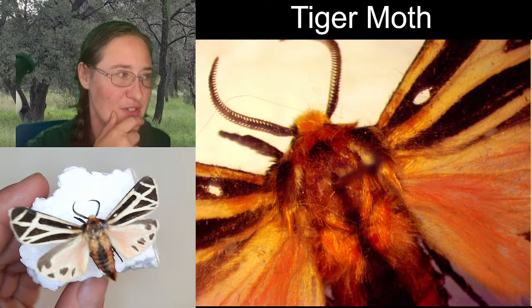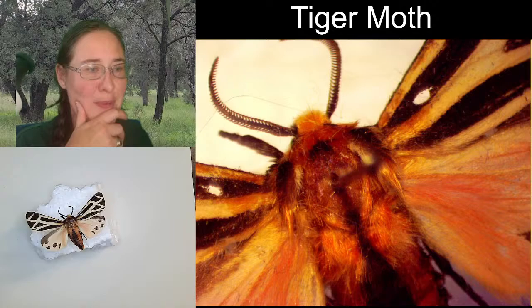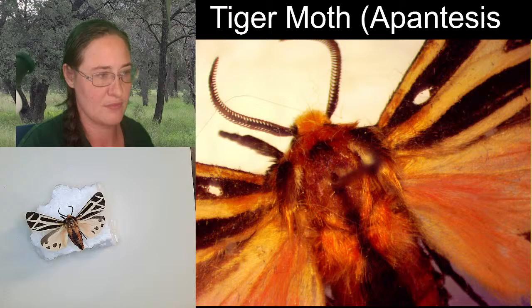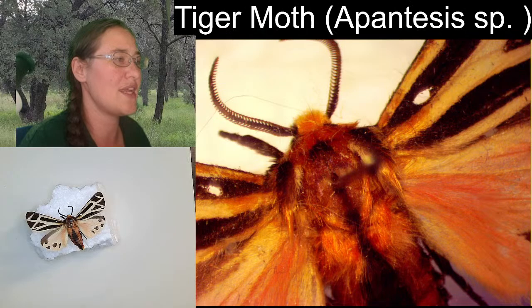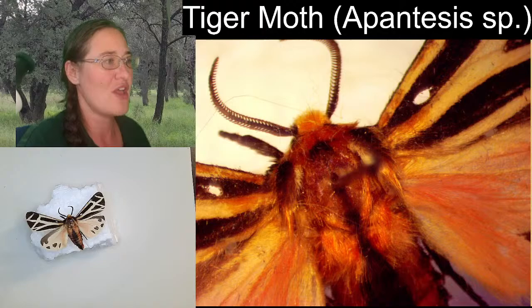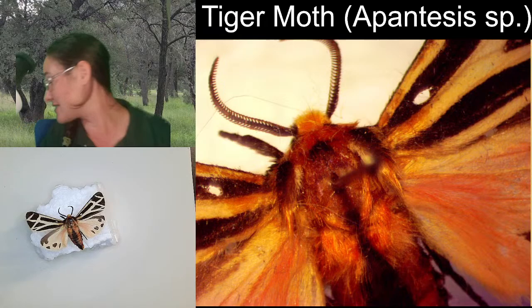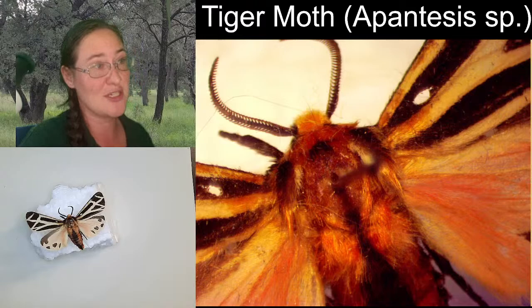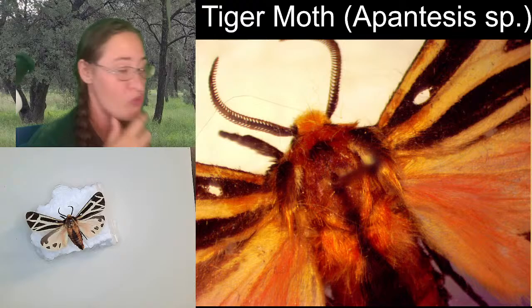But I'll get you the genus on this specimen, which is Apantesis, spelled like this. And we put SP at the end because we know that it is one species. There's only one specimen, so there's no way it could be more than one species. If we were looking at my small collection of Apantesis tiger moths, they have a variety of different spot patterns, so it is possible that I have multiple species, which is why I was trying to decide between 2 and 3. But alas.